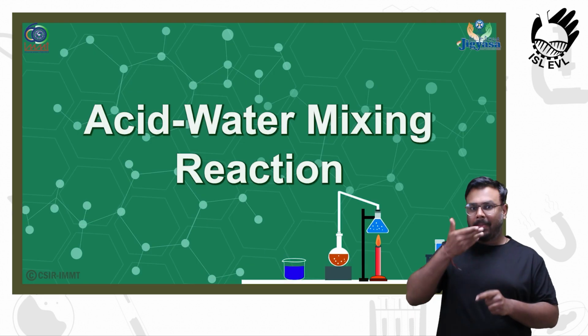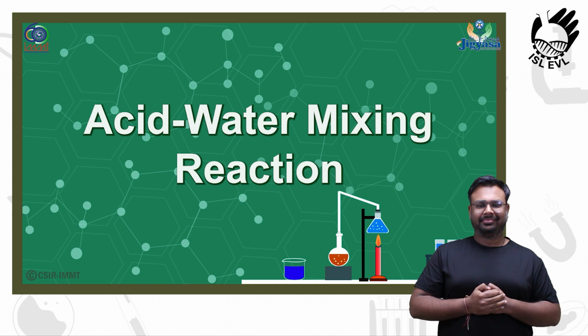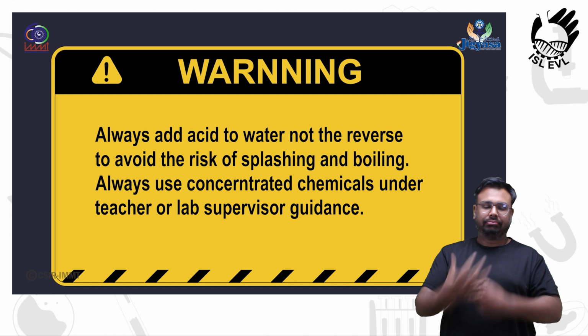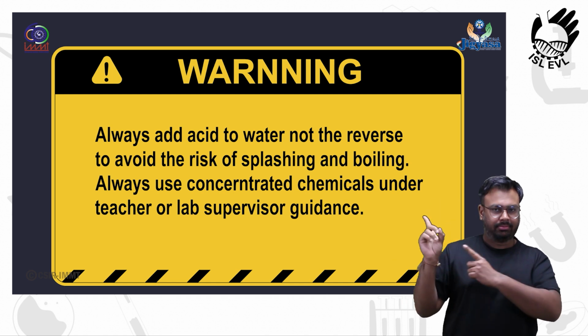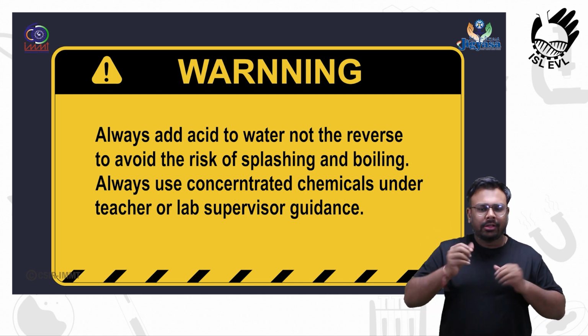Acid water mixing reaction. In this experiment, we will explore what happens when acid reacts with water. Warning: always add acid to water, not the reverse, to avoid the risk of splashing and boiling. And always use concentrated chemicals under teacher or lab supervisor guidance.